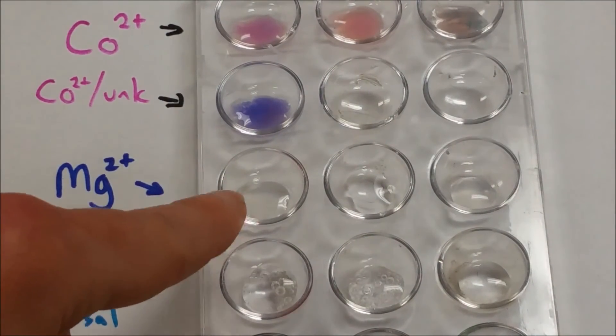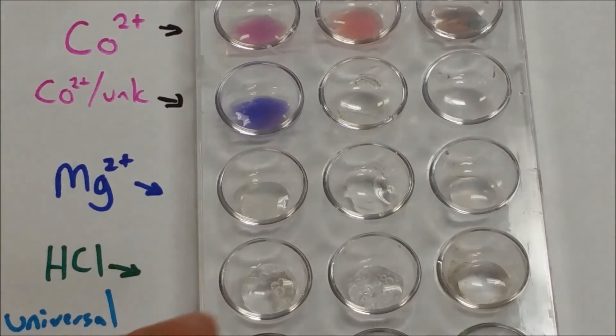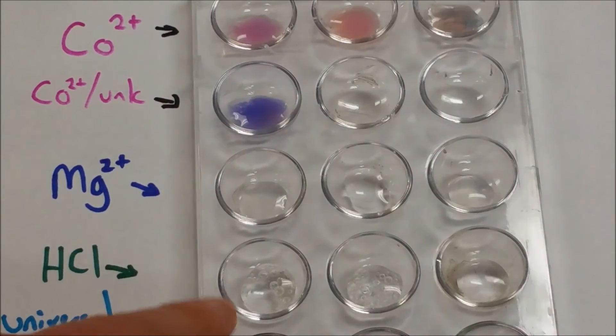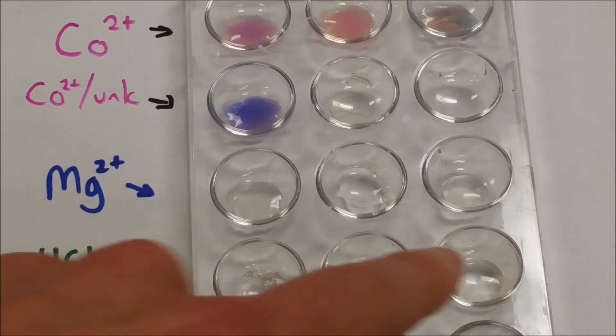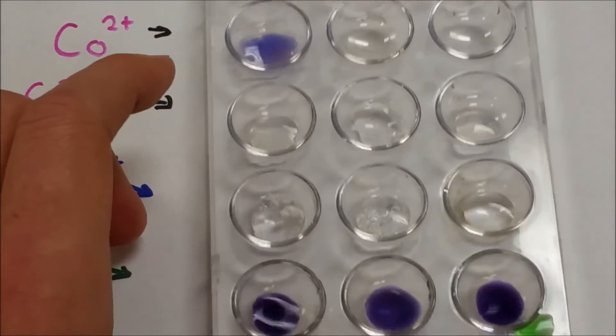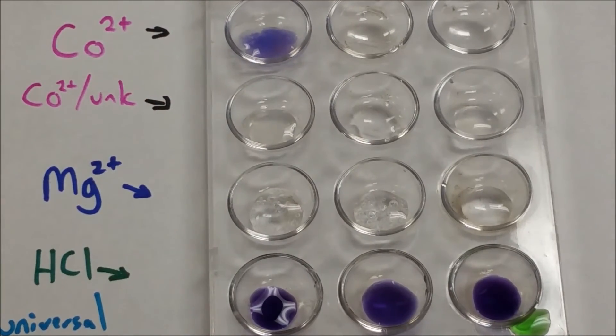Down here, you can't see the precipitates, but I'm going to move the background in a second. But here we can see bubbling, we can see bubbling and no bubbling. And then for the universal indicator, it looks like they're pretty much purple across the board.